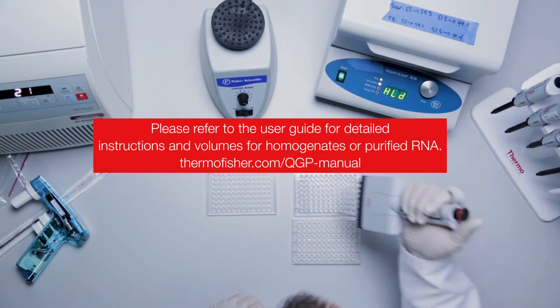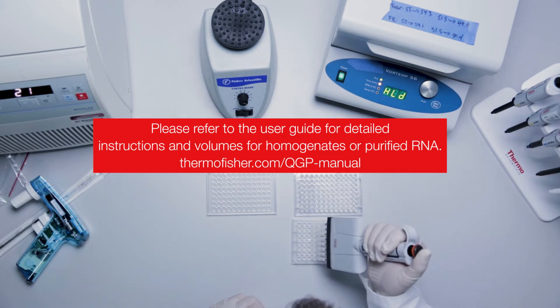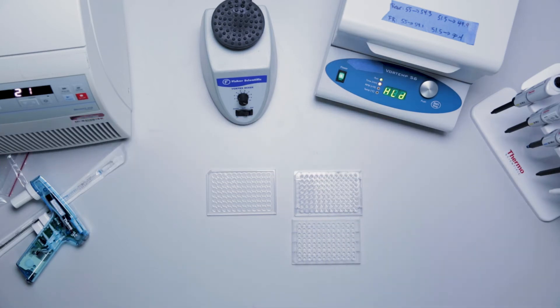For background controls, add 80 microliters of diluted lysis mixture. There is no need to mix the contents of the well after sample addition.